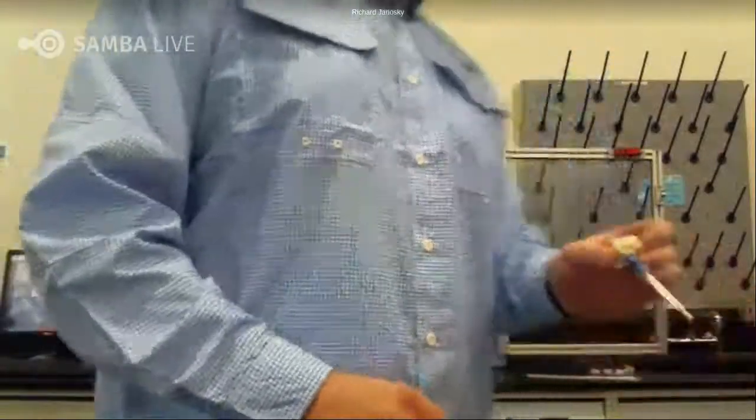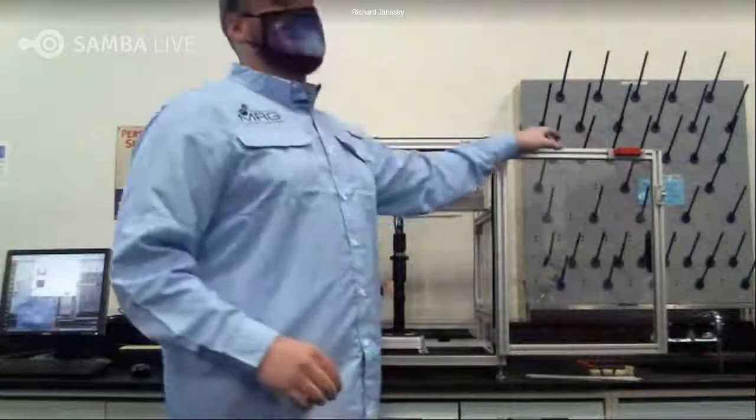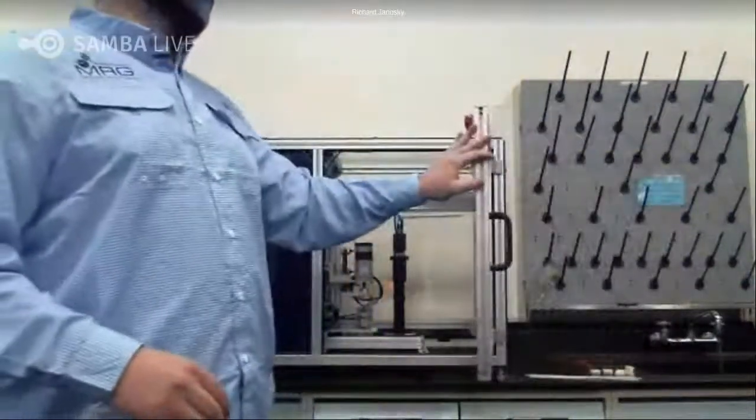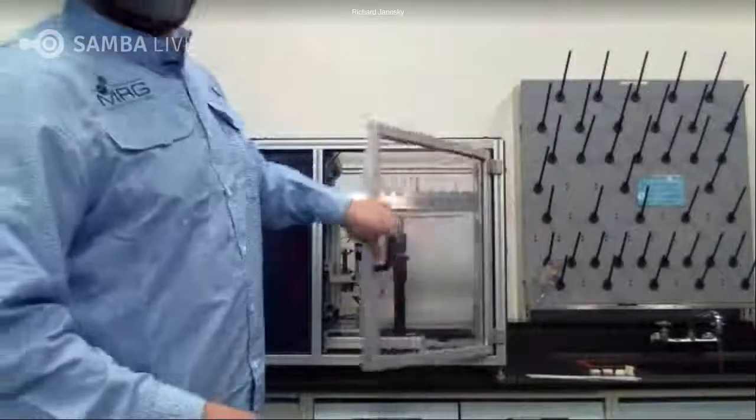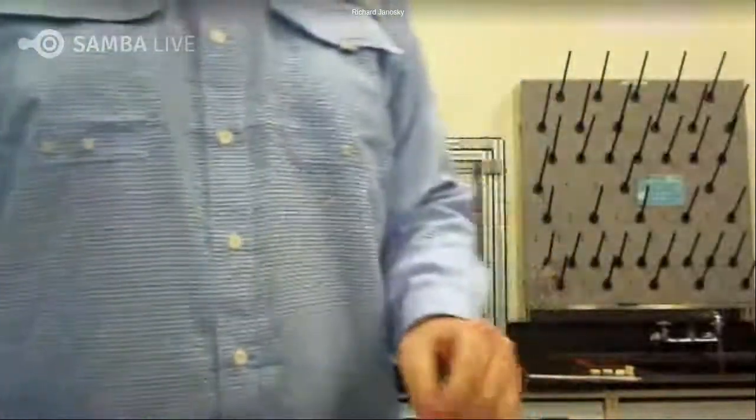And then now I'll take this and place it in our heating rack, and I'll allow that to come to temperature. That is how we ensure that all samples are run in a uniform manner.